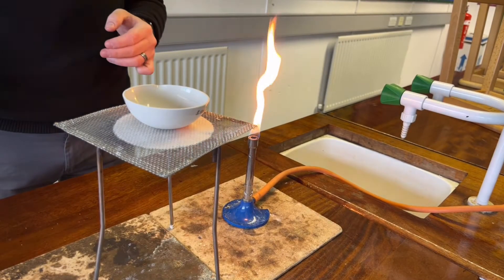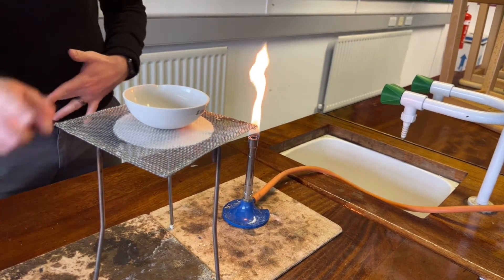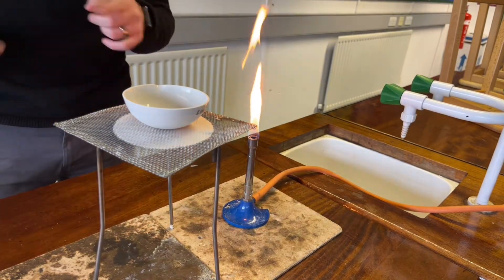The next method of separation is called evaporation, and this is our setup. We have a tripod, a gauze, an evaporating basin, heatproof mats, and a Bunsen burner.